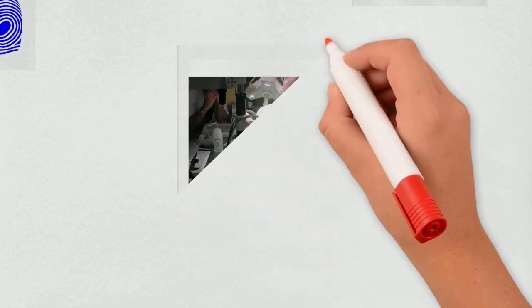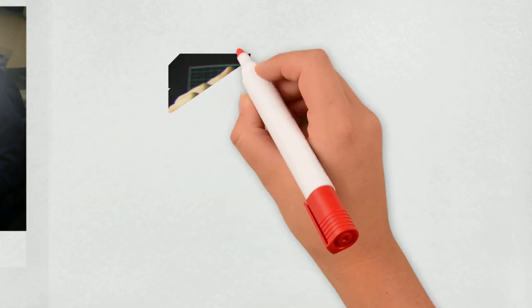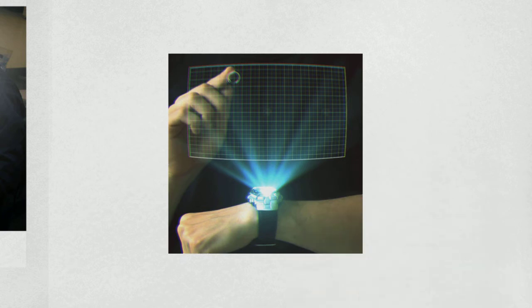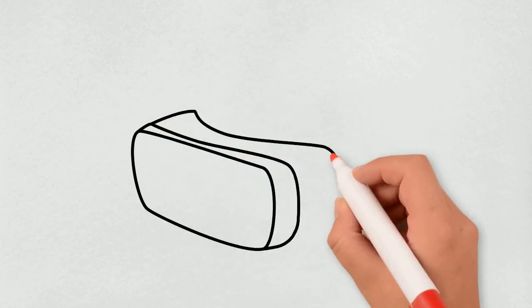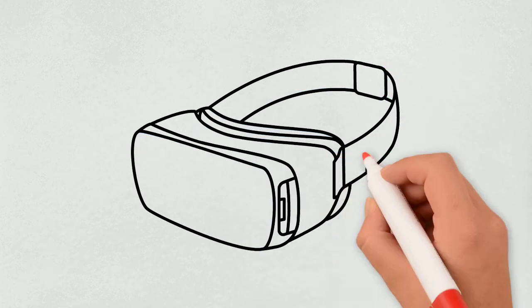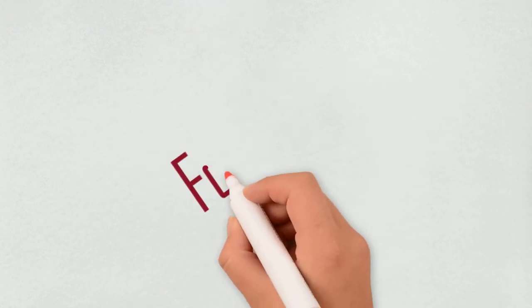Instead of having a traditional 2D view with a simple measurement, it has a whole range of magnification as well as special features like a 3D rotary head enabling 360-degree rotation around an object, for example to look inside the movement of watches. New developments in binocular stereo microscopes have a 3D effect implemented with a stereoscope approach, making it high resolution for one lens while the other works on the depth of field. Thus, it is super relevant for watchmaking.